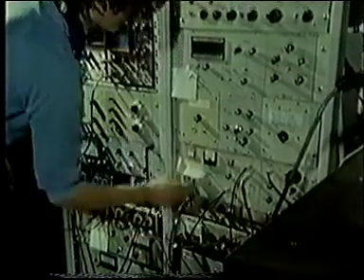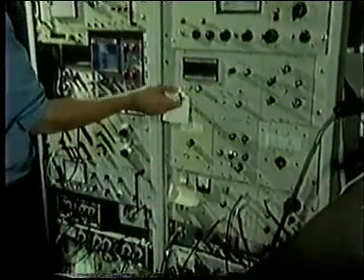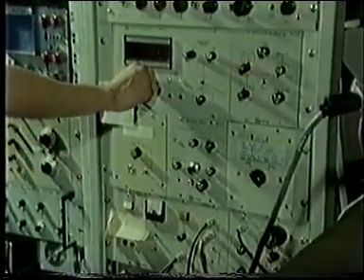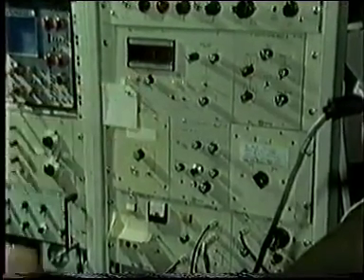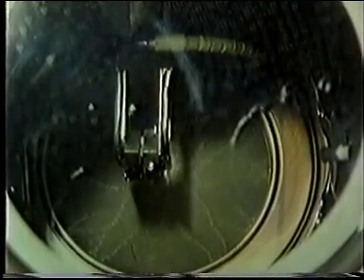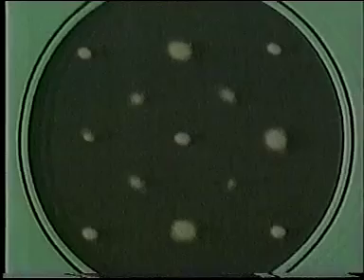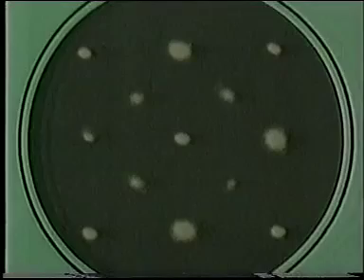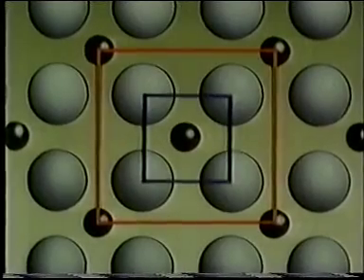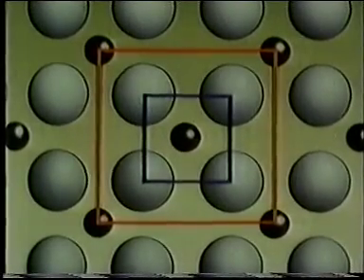The next step is to saturate the iron surface with monatomic nitrogen. A prolonged exposure to nitrogen gas will do it. About 10 to the minus 6 atmospheres for 12 hours at 600 degrees Kelvin. Now, has the LEED pattern changed? New spots have appeared. This new pattern bears a simple relationship to the old one. The relationship tells us that the unit cell of the adsorbed nitrogen atoms is centered, with a side twice that of the unit cell of the iron 100 surface beneath.